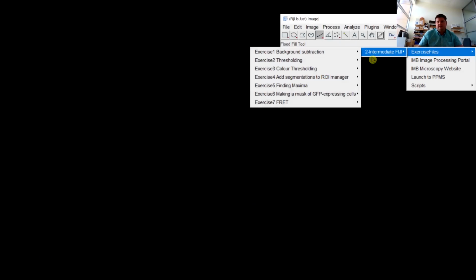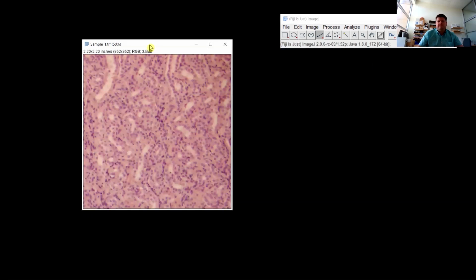And so I get my mouse back on that screen. I can bring up Fiji. We can get that sample image.